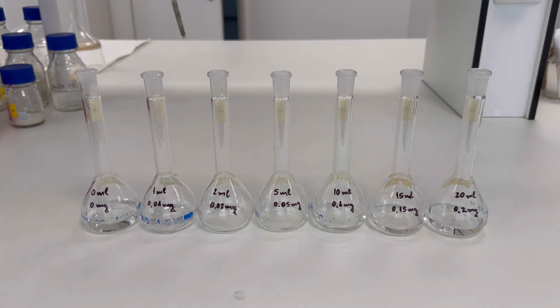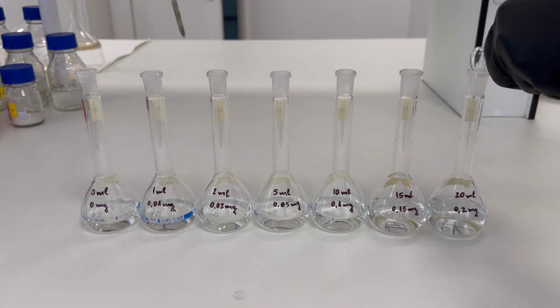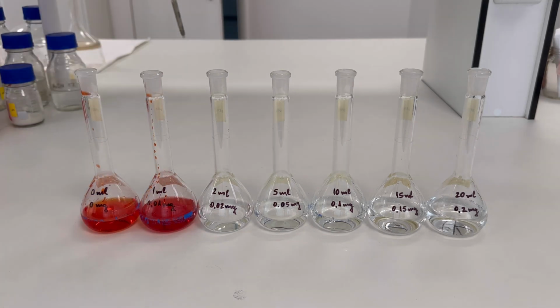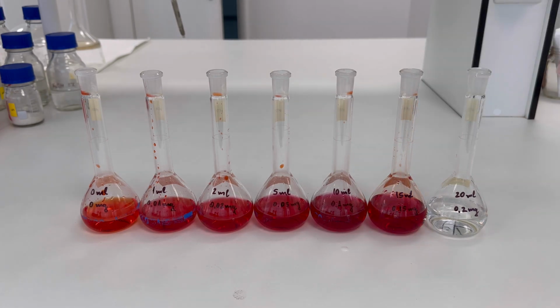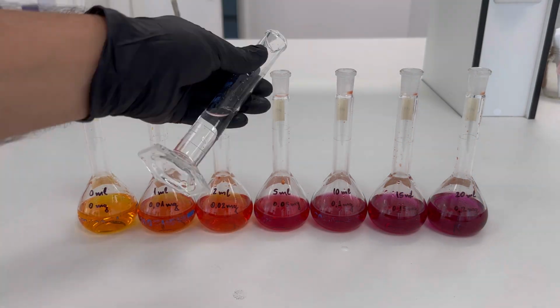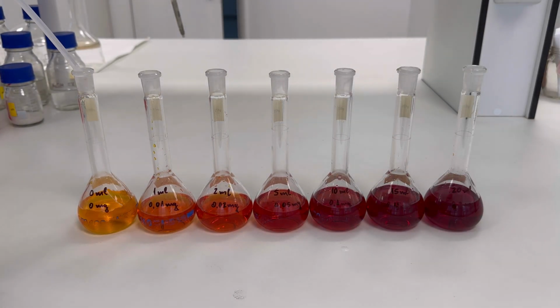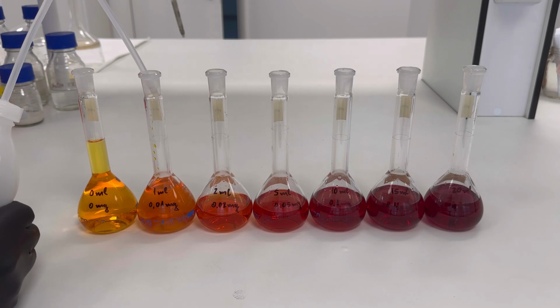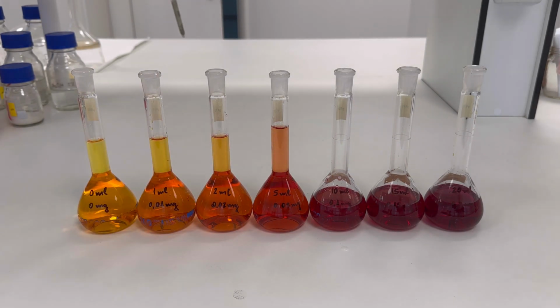Next, we add 25 milliliters of the sodium thioglycolate solution to each flask, followed by 7 milliliters of the Eriochrome cyanine R solution. Finally, we adjust the pH with 15 milliliters of the buffer solution. The flasks are filled with distilled water, and the final development of the color takes 20 minutes. After that, our calibration solutions are ready.